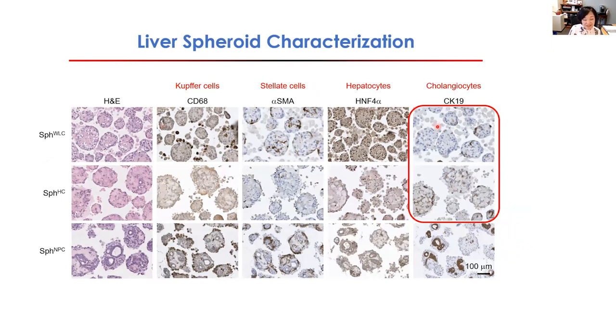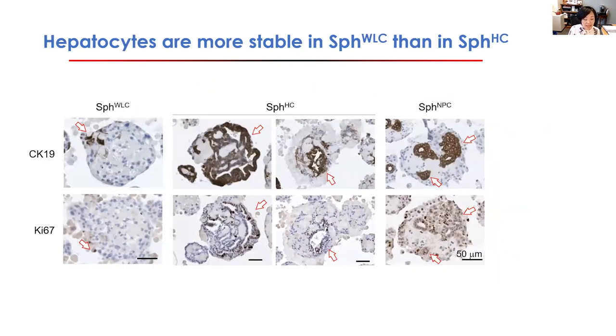So this is something related to what had been reported before: hepatocytes are not that stable in in vitro culture. They de-differentiate quite quickly. Once they de-differentiate, they start to gain expression of cholangiocyte markers, including CK19. Indeed, if we scan through all these different spheroids that we have generated, we often can find this type of really weird looking hepatocyte spheroids in our culture. You can see that these spheroids have a lot of CK19 expression.